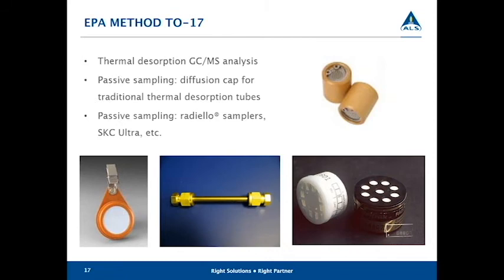In theory, they could be batch certified, but when people are doing ultra low reporting limits, they want that extra assurance that every detection is going to be verified. So if you want ultra low reporting limits by SIM, typically the laboratories will do individual QC, and there is an additional charge for that.